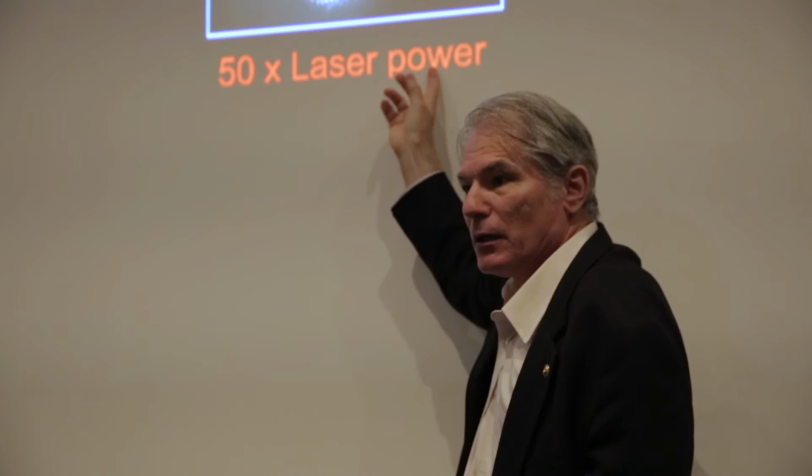But if you think about it, because the thing's in situ, we can generate as many of these as we want. So we generated a whole bunch of these pairs of stacks, where we had the low light stack and the corresponding high energy stack. And the thing's in situ, so it's not moving, so we know they're perfectly correct. Then we took what everybody's using, deep nets. We took what's called a deep U-net, and we trained it on this. And that was the trick.